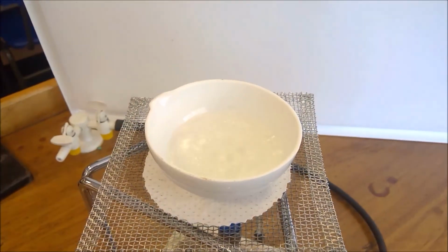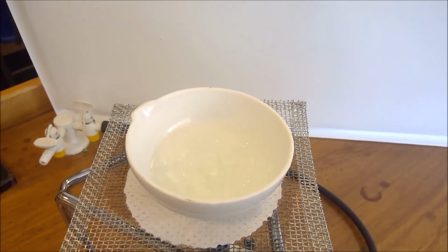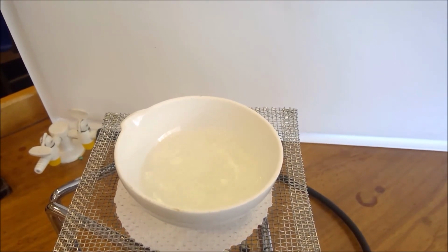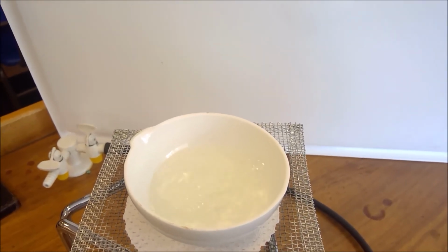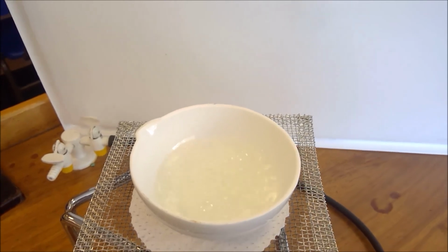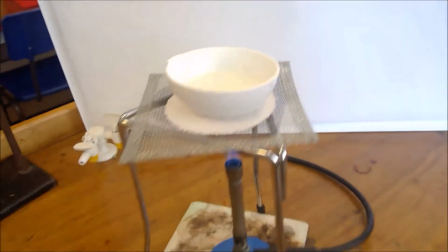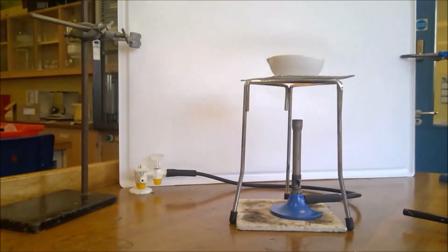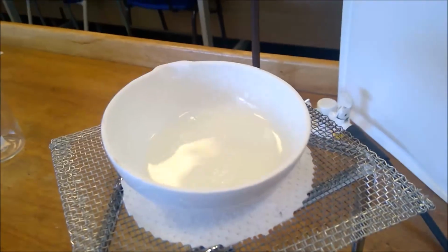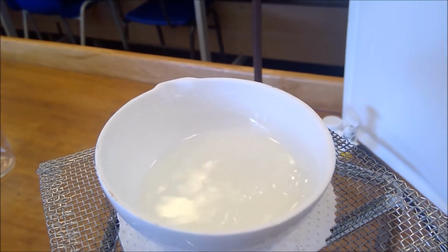So once I've put the camera down, I'm going to turn the heat down slightly. We don't want to boil this too fast. We just want a steady rate of heating, so that we can slowly drive off our water, and then we'll keep an eye on it until we can see crystals starting to form at the edge. So having another look over here now, we've certainly decreased the rate of bubbling quite a lot there.